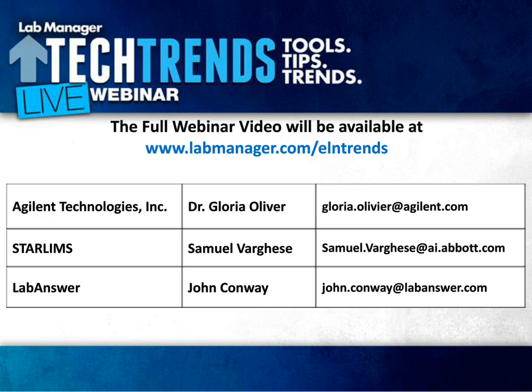Great, thank you. How about capturing photos and that sort of thing? Are ELNs capable of doing that? This is Sam. Certainly you're able to import any kind of picture, or some kind of file you'd like to make part of the record. Maybe it's something that came off of a microscope. You can certainly bring that into the ELN and then annotate it if you want and make that available as part of the record.